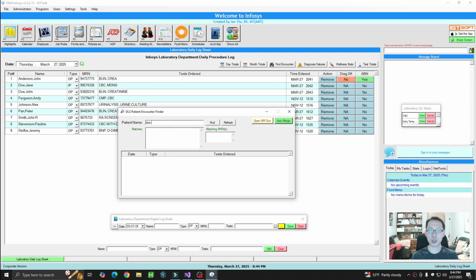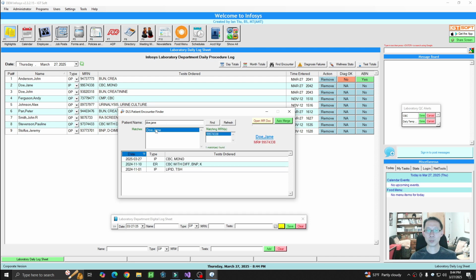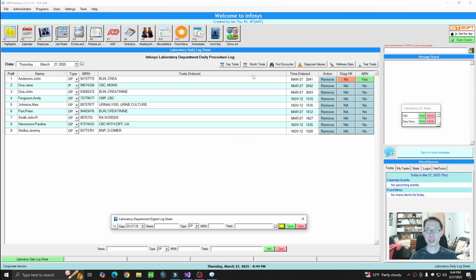So we'll just say Jane, it's going to pull Jane Doe, and this is the medrec number, and these are all the past tests that she had done in the system. Just a quick way to pick that up, and then I'm just going to X this out. Quickly showing you guys some of these functionalities.